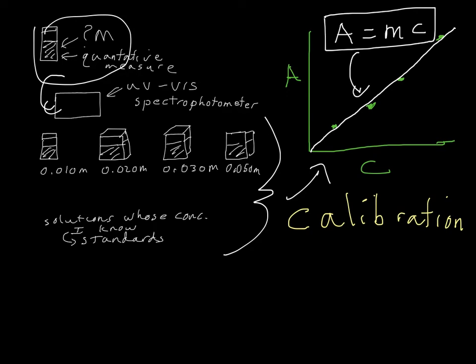This is an important, crucial job of a chemist. Matter of fact, if you've got a job in industry as an entry-level chemist with a bachelor's degree, one of your big jobs on a daily basis would be to calibrate an instrument, or at least run check standards to make sure that the calibration of the instrument was still valid.